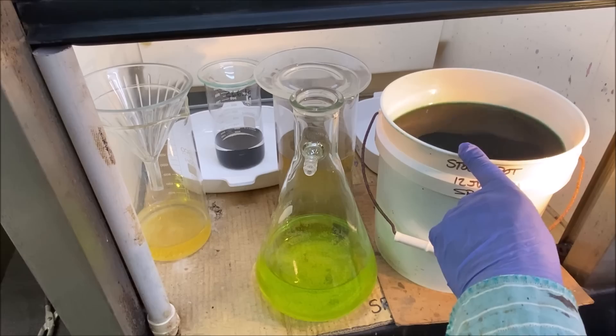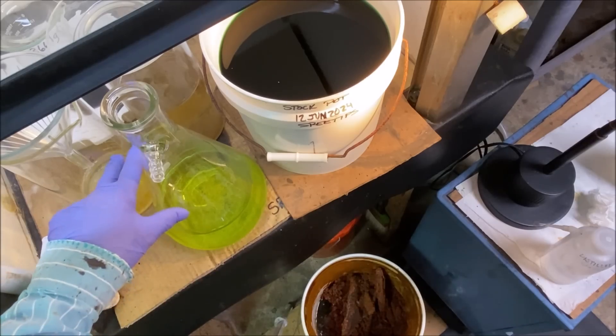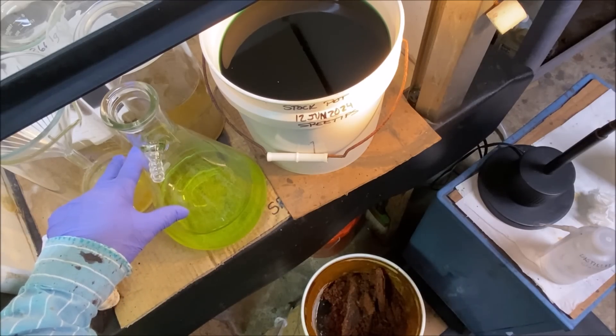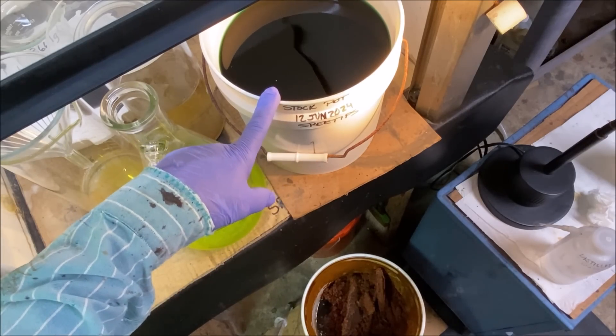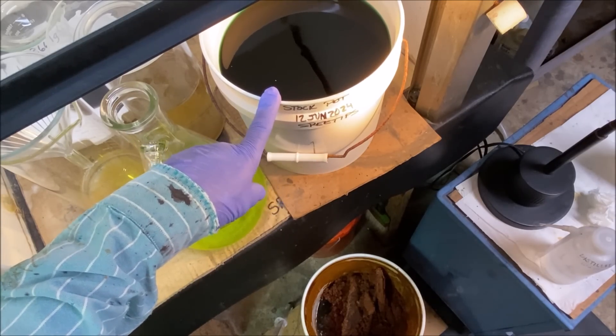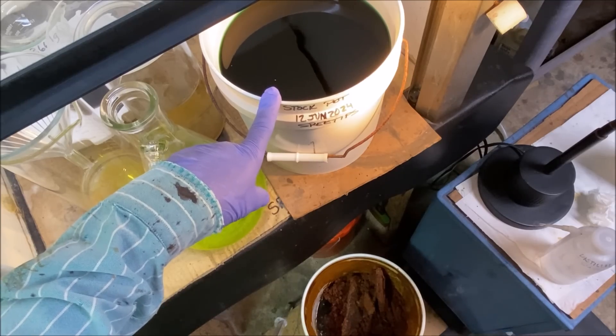These waste solutions contain platinum group metals, which are highly toxic in solution. So the first step in the waste treatment process is to remove the toxic platinum group metals in my stock pot.